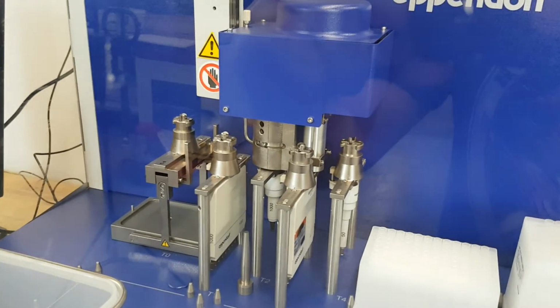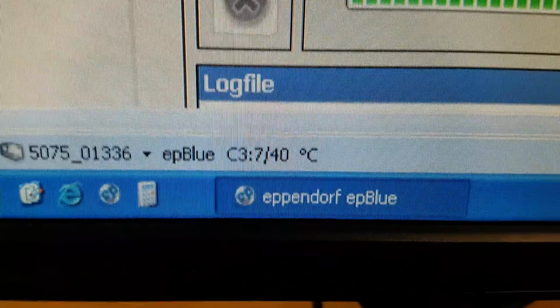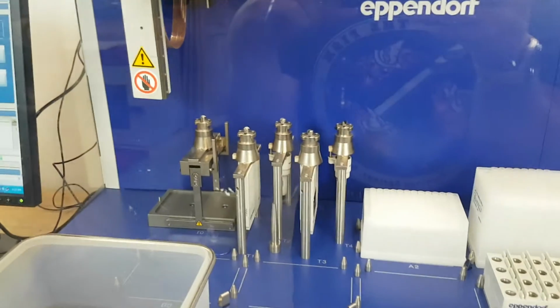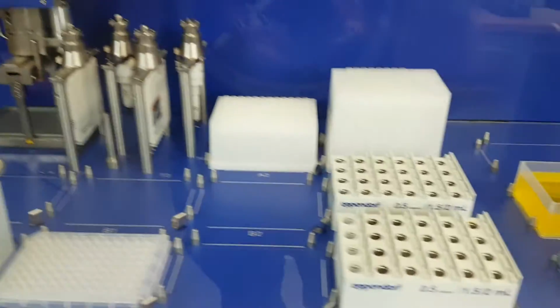So it's going to drop this now. We've also instructed the thermal module to start heating. So it's already on its way up. We'll check in again when it finishes the example to show you how fast it can warm up the position. And this is with a heavy metal thermal block on it.